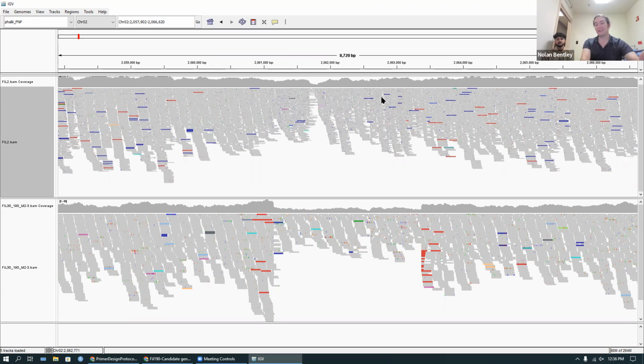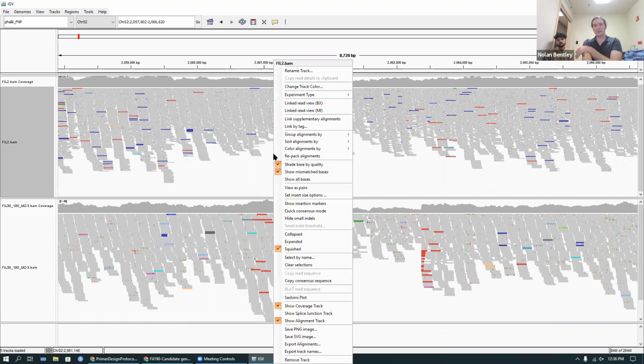The reads that belong there, the algorithm couldn't figure out where to put them. And so it's mostly not sequenced. However, that's clearly different from what's happening down here. Now, you can see it, and that's cool, but it's actually not a terribly useful visualization. There are some colors being thrown around.